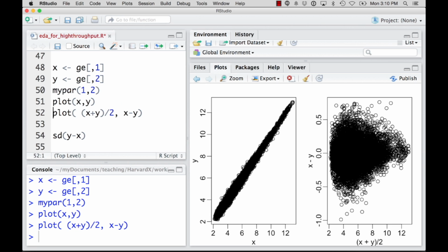Right, so now we can see the variability is not that small. It's not that big, but it's not that small either. Here it appears to be very tight, but there's actually differences of log ratios of 1 in some instances, -1 in some instances. So that is the MA plot that's very commonly used. We sometimes discover patterns in the data that aren't seen in the scatter plot, but that we can in fact see in the MA plot.